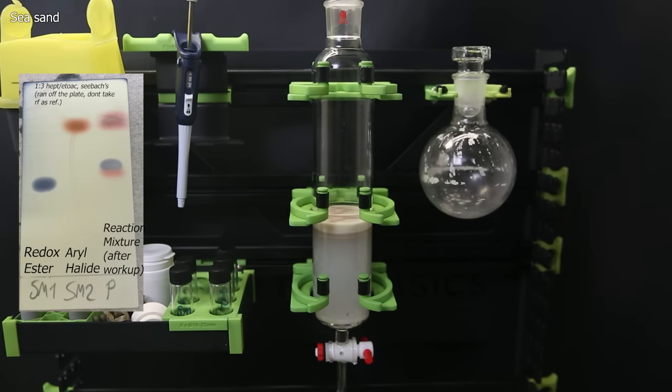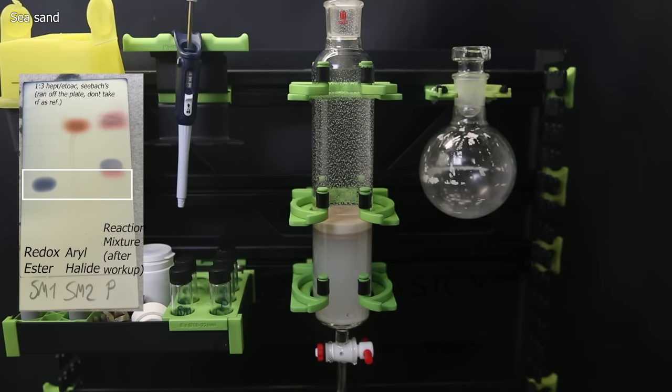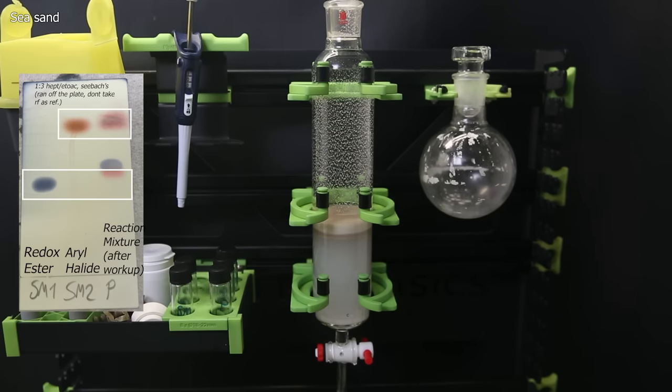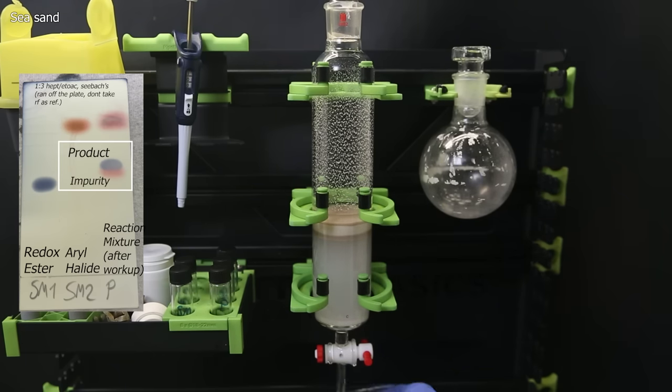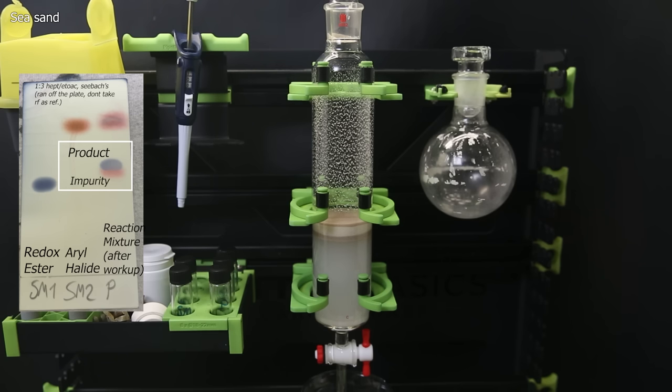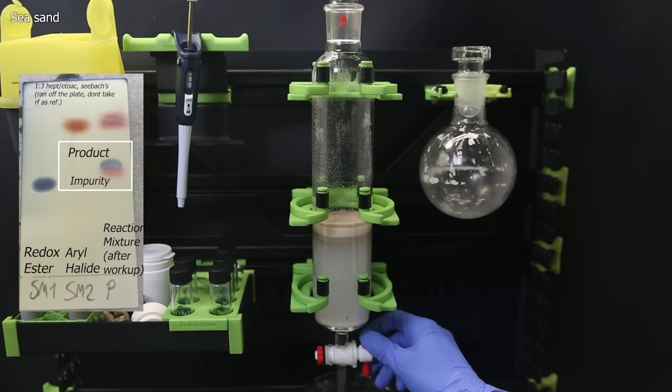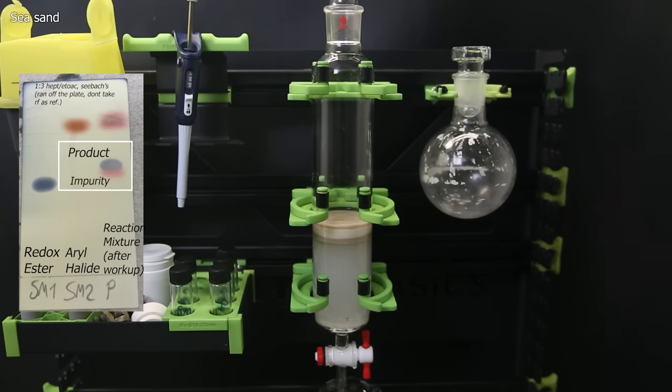The TLC of this product shows that the redox active ester has completely disappeared, and the aryl halide that was in excess is unsurprisingly still present. Besides that, we see 2 new spots that are very close together, which makes them difficult to separate. The reddish spot is an impurity, and the blue spot is the desired product. The TLC doesn't tell you how much of each compound is present. Some compounds stain extremely strongly, even if it's like 1% of the total. If we assume that this is also the result the literature got, this impurity should be insignificant, and so it doesn't matter if it ends up with our product.